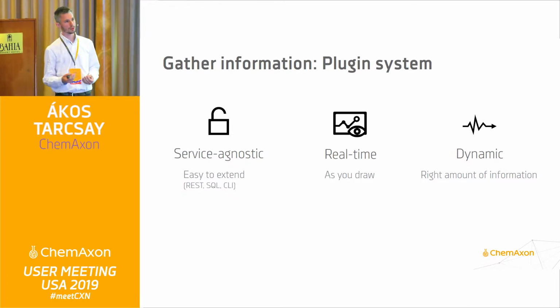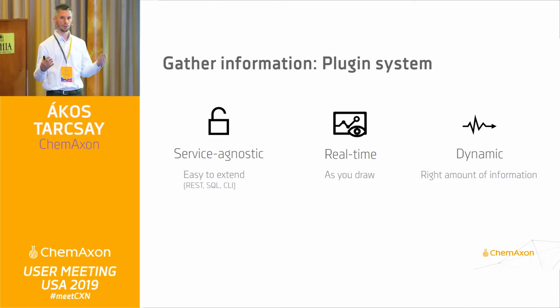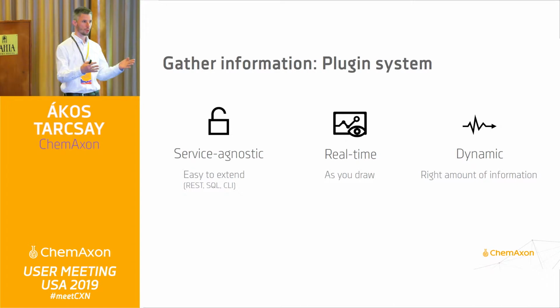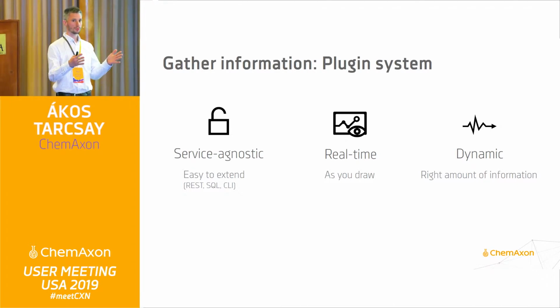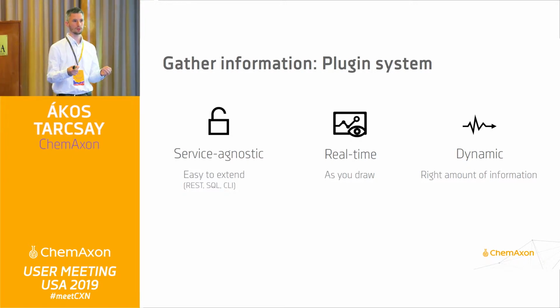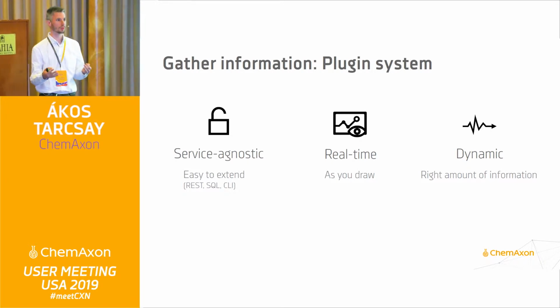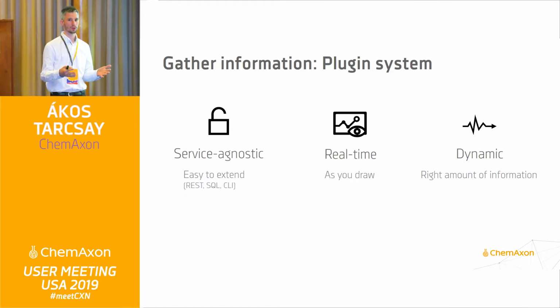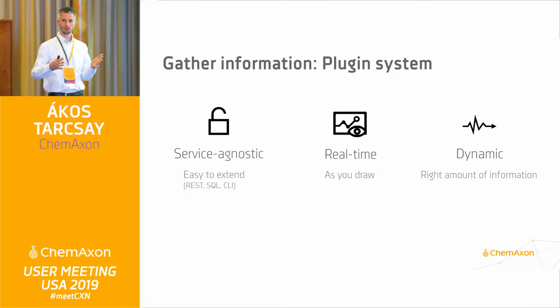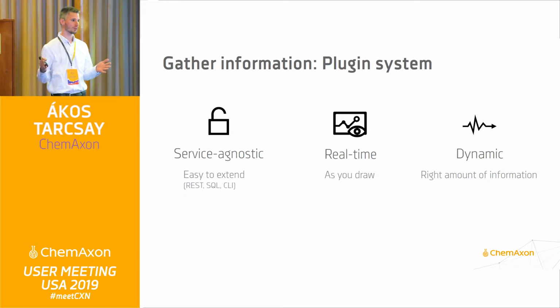And the third one is that it's dynamic. Drug discovery is a multi-objective or multi-parameter optimization process. However, you might not follow all of the calculated properties.